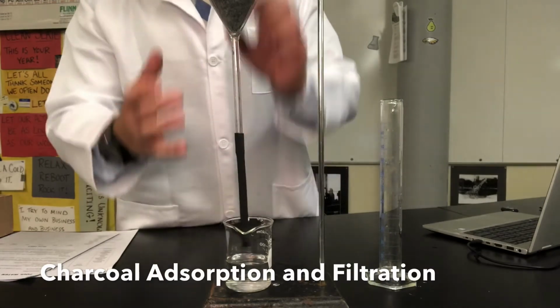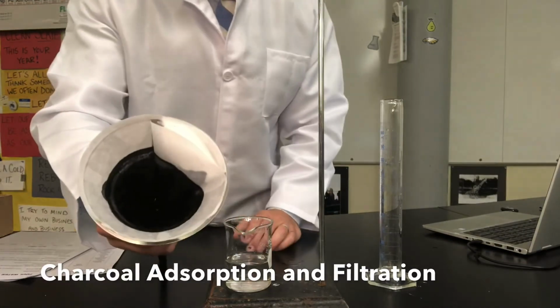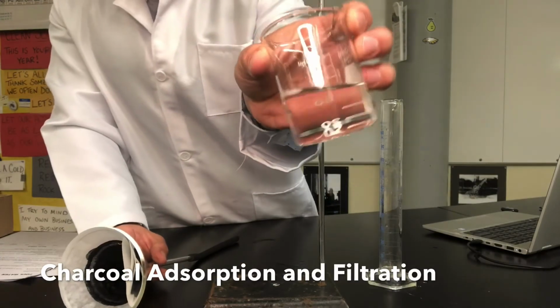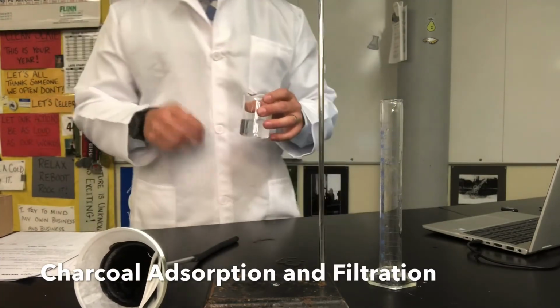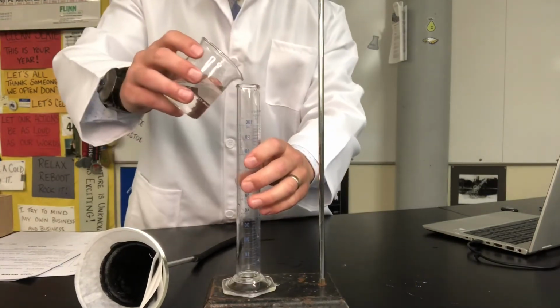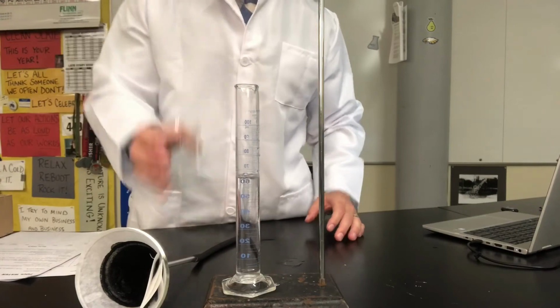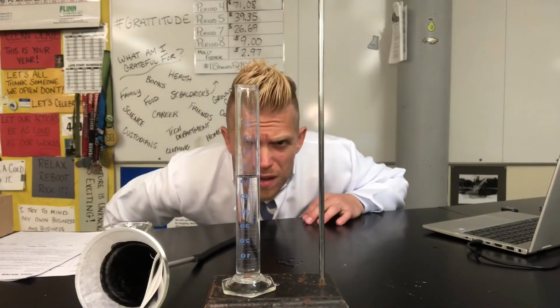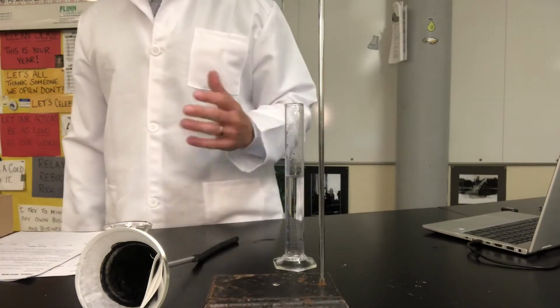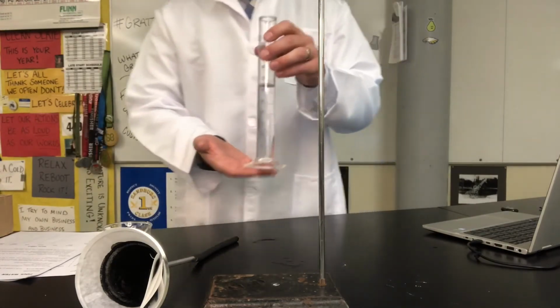So we're back, and we have officially filtered out the charcoal. Take a look at that. The filter paper left all that charcoal behind, and look at our clear water sample. Wow. Awesome. So it's amazing what physical separation can do to clean water. So let's do a couple last pieces of data. I'm going to measure the final volume in my graduated cylinder. And if I look at it eye level, it looks like it's at 65 milliliters. So quite a bit of the liquid was lost in these final few steps. We started with 100 milliliters, and now we have 65 milliliters of water left.